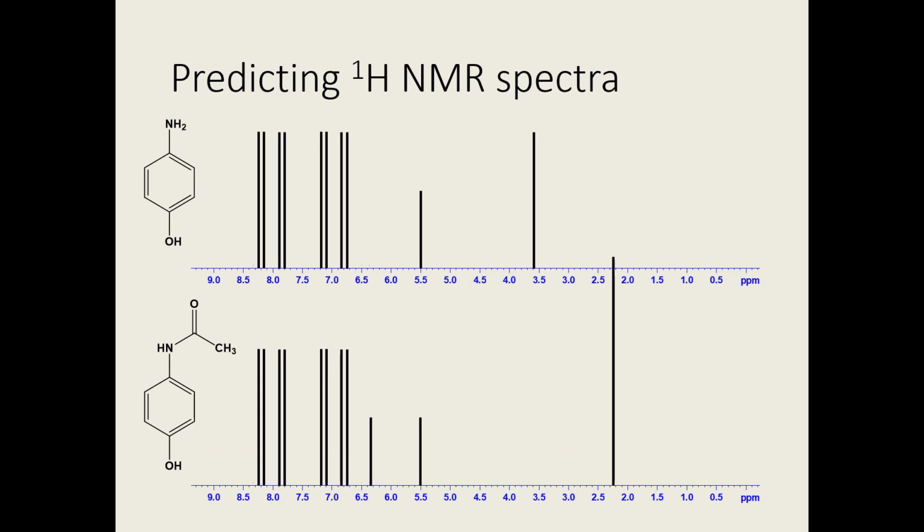To see whether the reaction has been carried out successfully, we can look for the signals which are unique to the starting material and the product. The changes we would expect are the amine becoming an amide and the addition of the CH3 group.